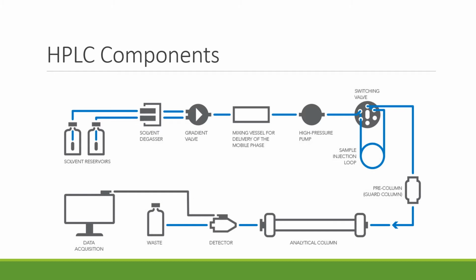In the next slide, there's a video I want you guys to watch that will also help explain some of the components of HPLC.